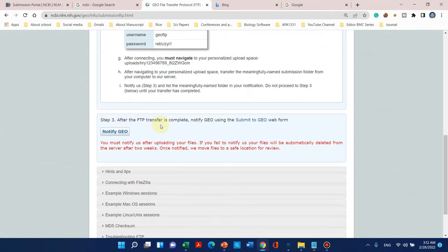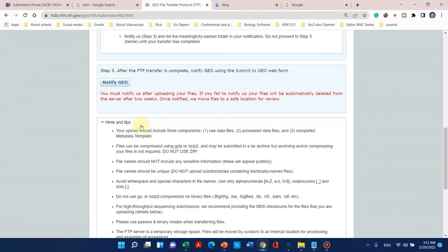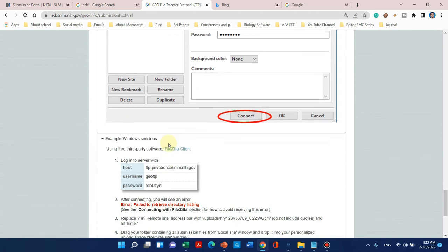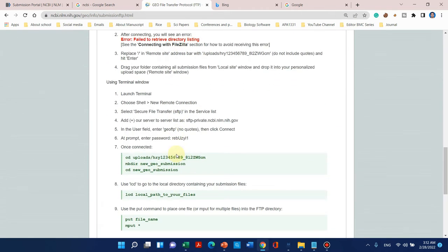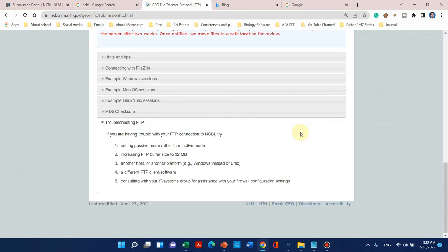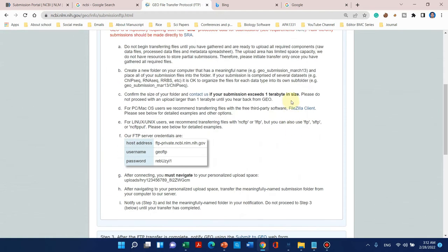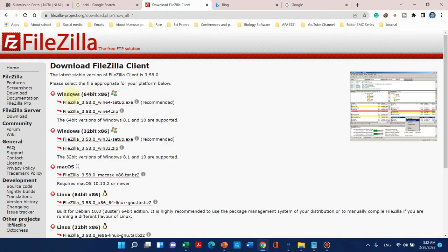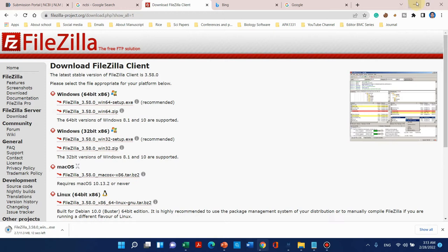We can use this software to transfer data. For downloading, we can simply click on the download link. Here is the demo of that software. When you click on the FileZilla client and it will ask which version you want — you can check your computer configuration. Because my computer is 64-bit and I am using Windows, I will select that option. A file will be downloaded and you can install it simply.